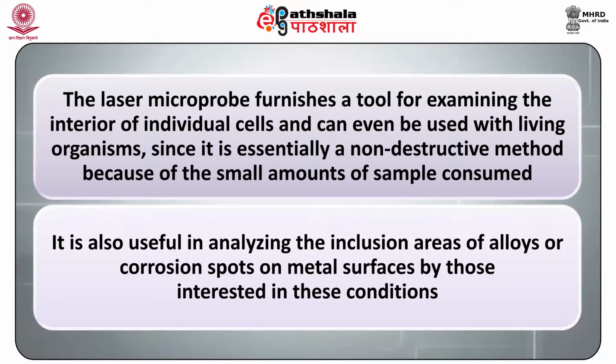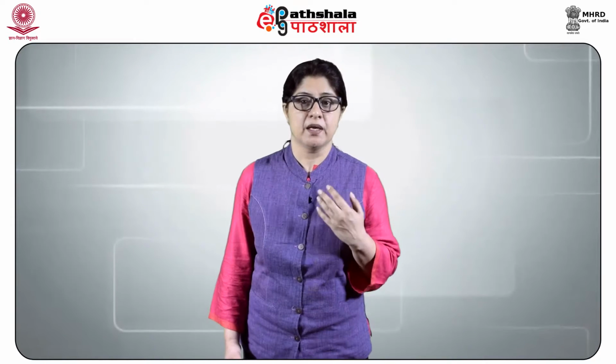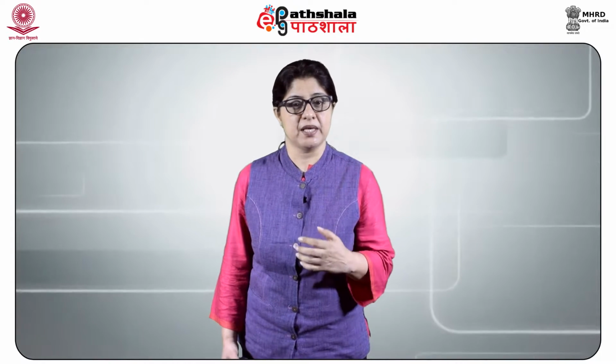The laser microprobe furnishes a tool for examining the interior of individual cells and can even be used for living organisms, since it is essentially a non-destructive method because of the small amounts of the sample consumed. It is also useful in analyzing the inclusion areas of alloys or corrosion spots on metal surfaces by those interested in these conditions. Resolution of the laser beam is currently limited to 50 micrometers by the lenses used to focus the laser beam.